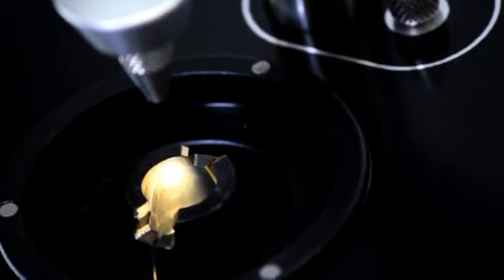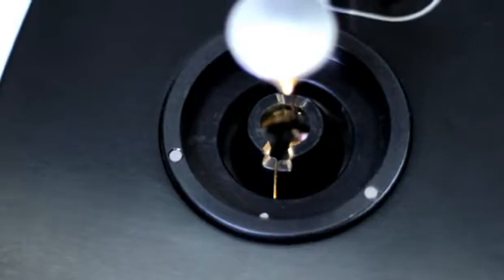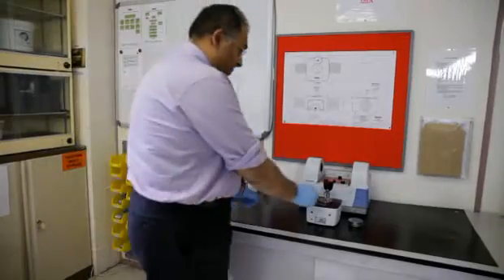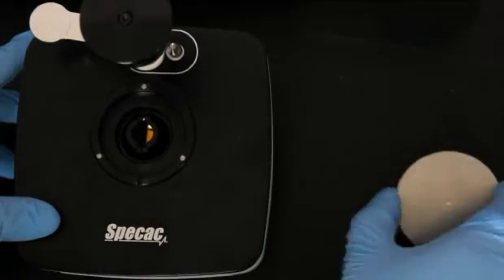The product's innovative optical design is based around all-reflected gold optics and SPECAC's synoptifocal array technology which uses spherical mirrors. Interchangeable ATR crystal pucks easily fit upon the optical unit and are now magnetically held in place.